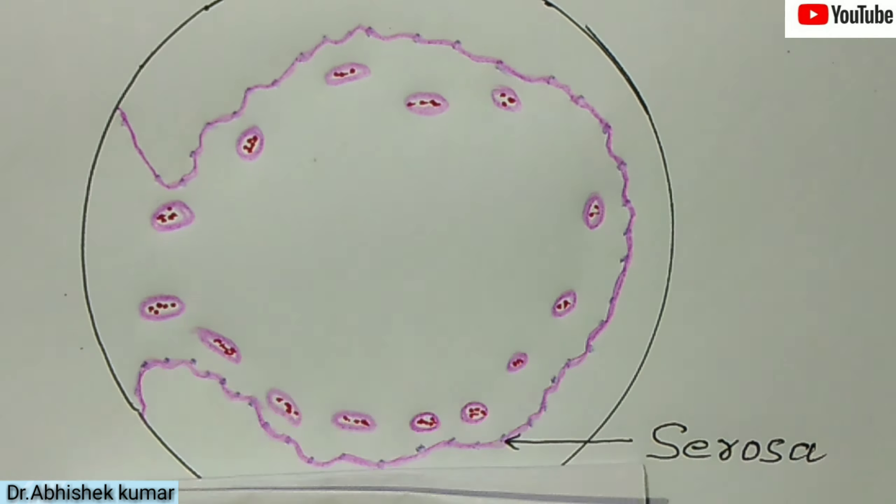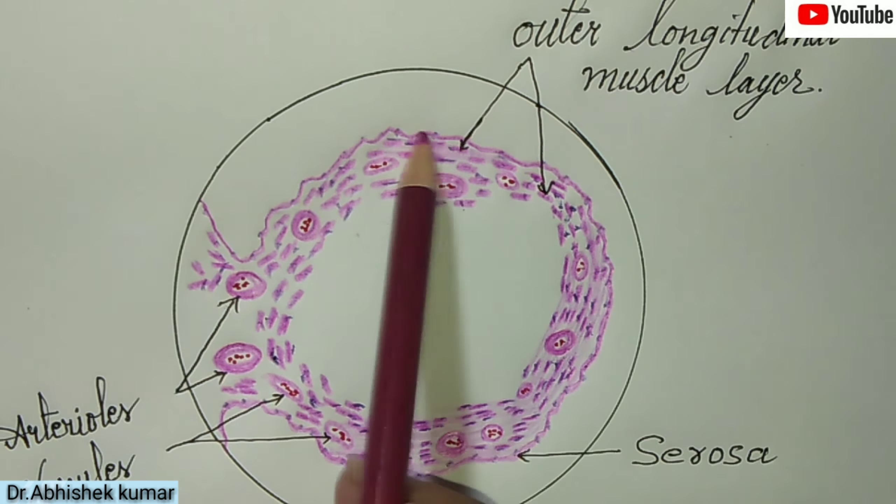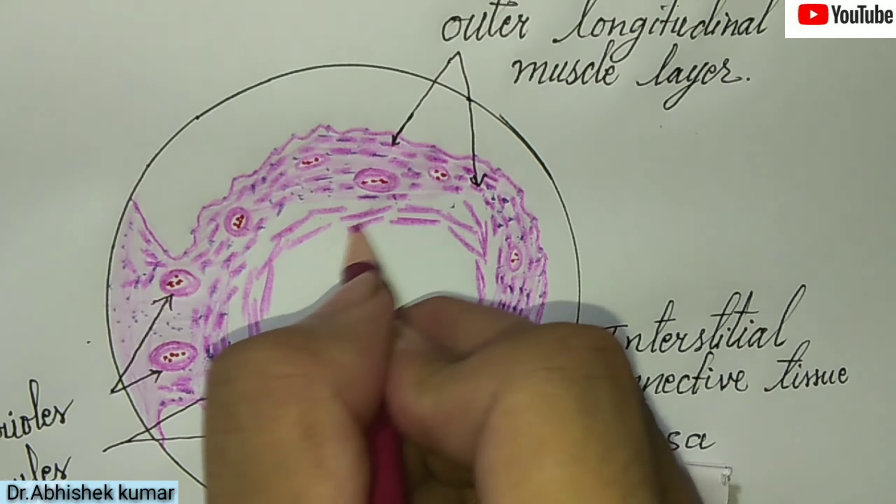Now you can see on your screen that we are marking the outer longitudinal layer. This outer longitudinal layer is separated from the inner circular layer by the interstitial connective tissue. In pink color I am separating the interstitial connective tissue, which separates the inner circular layer and the outer longitudinal muscle layer.